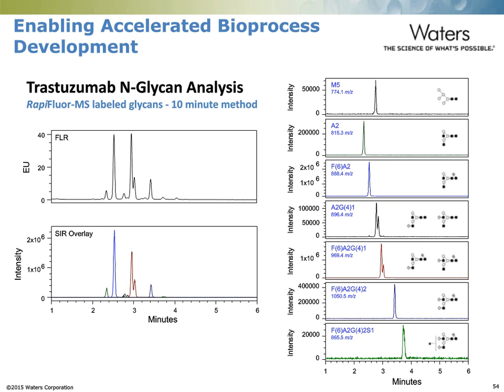So again, each of those structures we can clearly see and are cleanly depicted within their selected ion chromatogram.